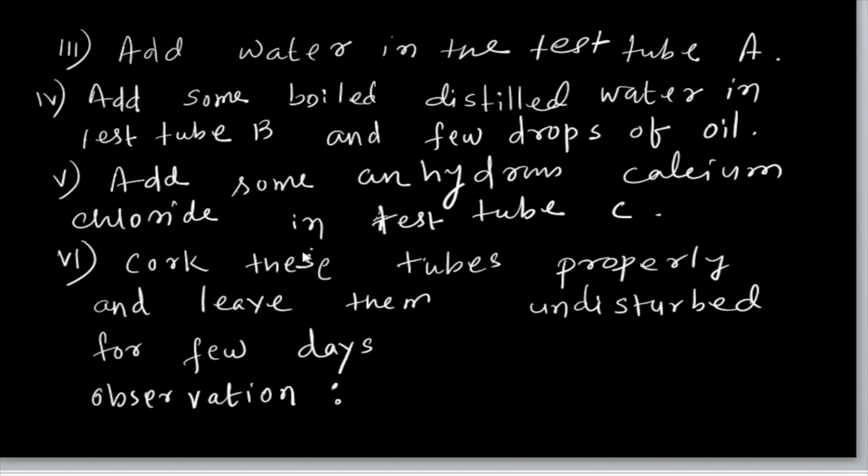That oil is protective, and that means that layer will divide the outer side and inside the water. That means here few drops of oil becomes a layer over the water.